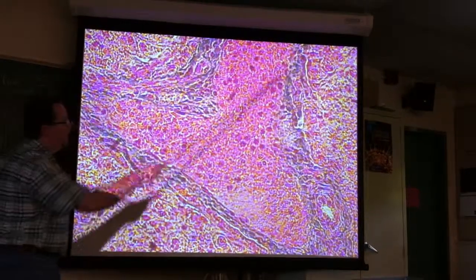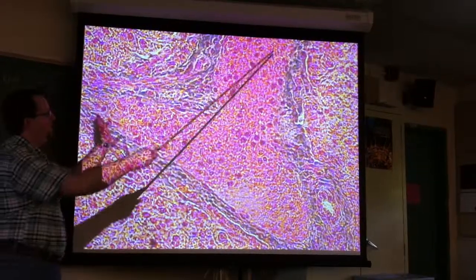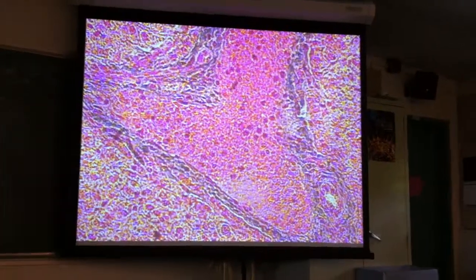I've got two of the three structures here. I've got a wide branch right here of the hepatic portal vein, the squamous epithelium. In the lower right-hand corner, a little tiny tubular structure with cuboidal epithelium is the duct. So there's the hepatic duct right there. And this great big thing is a branch of the hepatic portal vein. You can see it's branching. So this slide is not very good for liver.